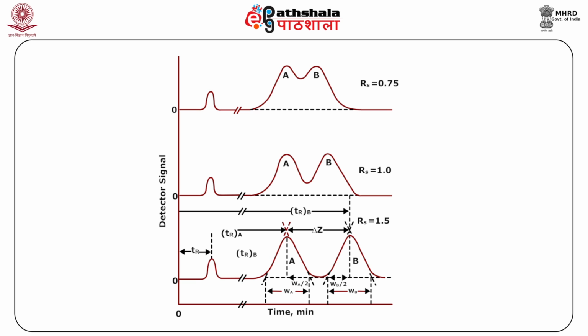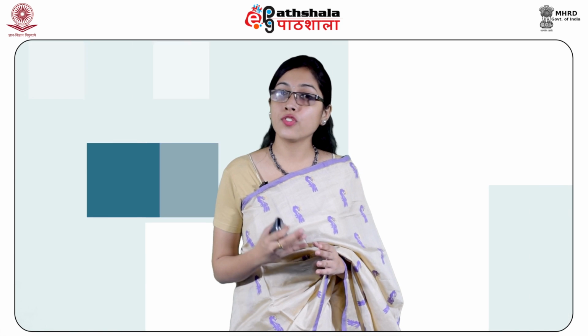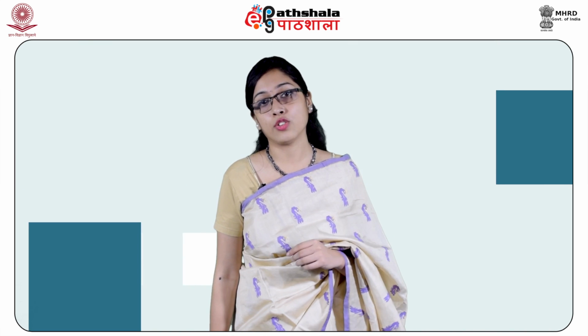As is clear from the figure, a resolution of 0.75 results in incomplete separation. At a resolution of 1, there is 4% overlap of peaks. Complete resolution is obtained at a value of 1.5. The resolution for any given stationary phase can be improved by using a longer column. This increases the number of plates, although it also increases the time required for elution. A compromise is generally made between time taken and resolution.